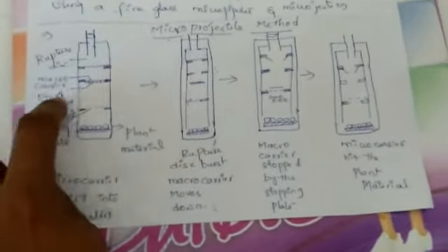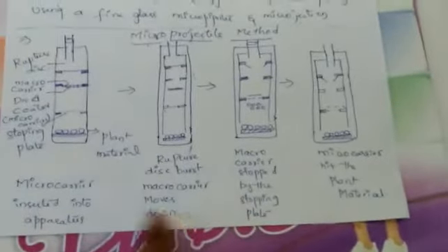The macrocarrier is the carrier of the microcarrier. After pushing down these macrocarriers, when the macrocarriers move down, the disc is ruptured.